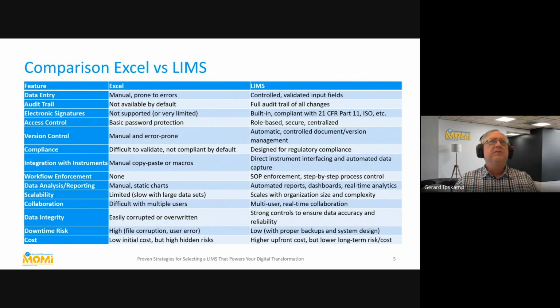So first, talk about Excel. Many companies, many laboratories still use Excel. In one of my educations, I have a fun question, and I ask what MES means, and MES means many Excel sheets. So that's in many companies still the case, and laboratory is not an exception there. Currently I'm working in an agriculture laboratory, and even there they have a LIMS, but still they have so many Excels around that you wonder how that can be supported and how that is working.